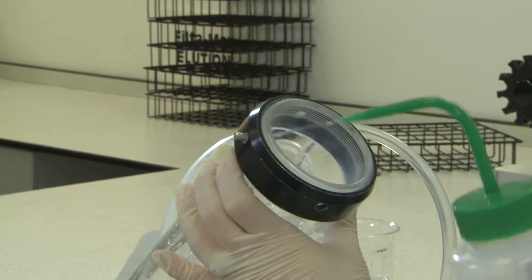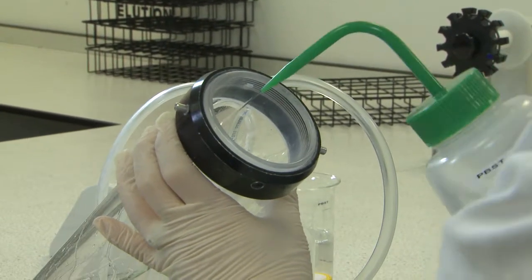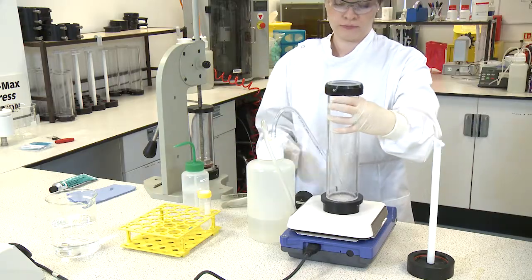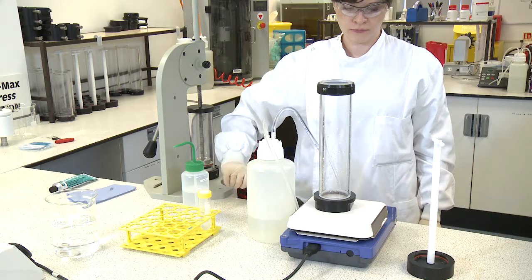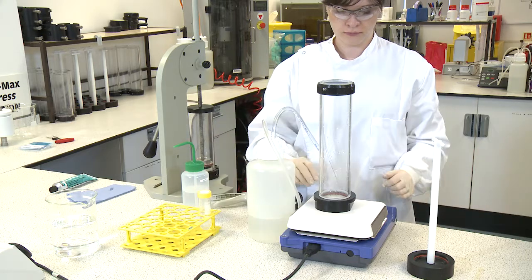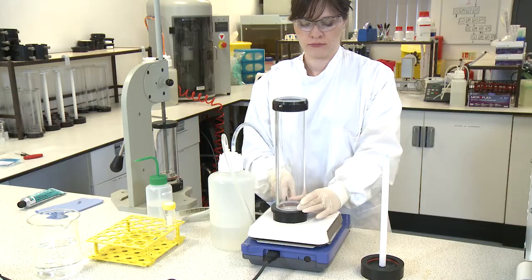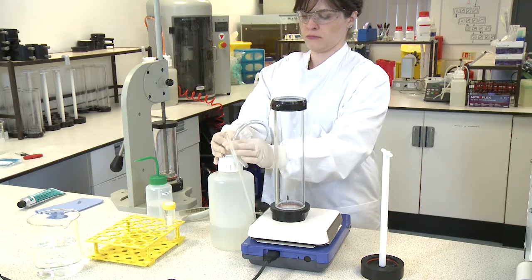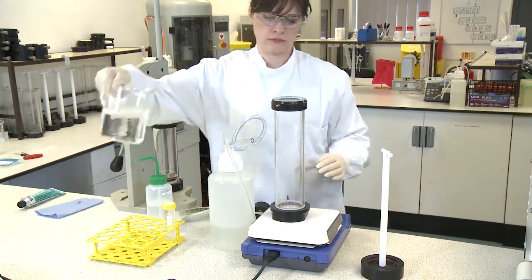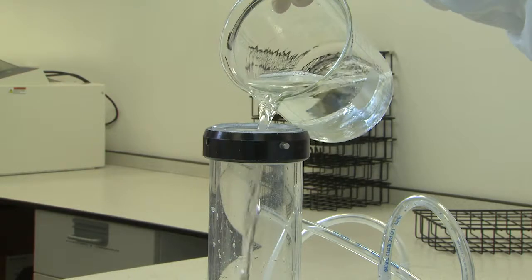Rinse the inside of the assembled concentrator tube with PBST. Open the tap on the concentrator base to concentrate this rinse volume on the membrane. Close the tap and detach the hand pump from the concentrator base. Add a further 600 milliliters of PBST to the same assembled concentrator tube.